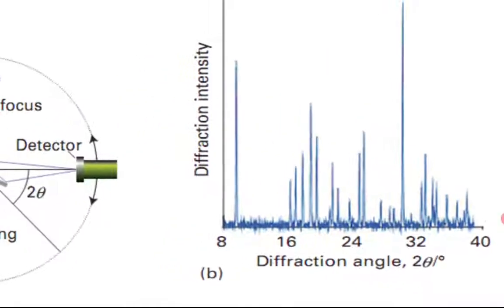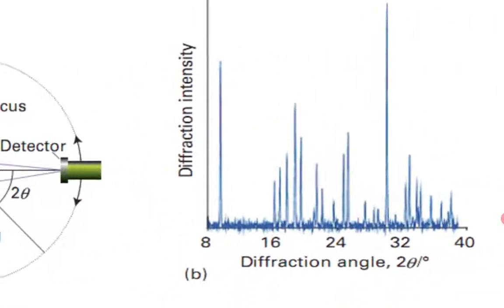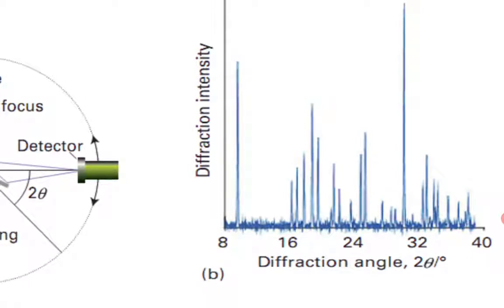You can see in this graph the form of a typical powder diffraction pattern, showing a series of reflections as a function of angle. The number and position of reflections depend on the cell parameters, crystal system, lattice type, and wavelength used to collect the data. The peak intensities depend on the type of atoms present and their positions.